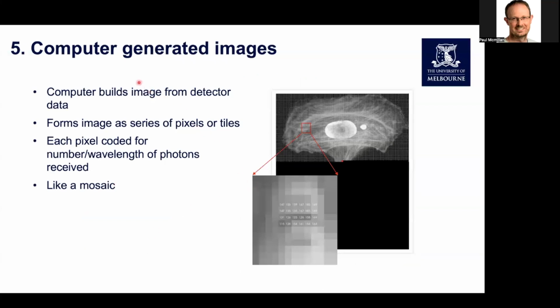I mentioned that the system is generating the images. So with confocal, we're scanning across, assigning intensities into pixels as we go. So it takes time to acquire this data. At the end, we see it as an image, but essentially it is an Excel spreadsheet of intensity values, right? So each pixel has its own intensity value, and we use that to build up the image that we can see on the screen.